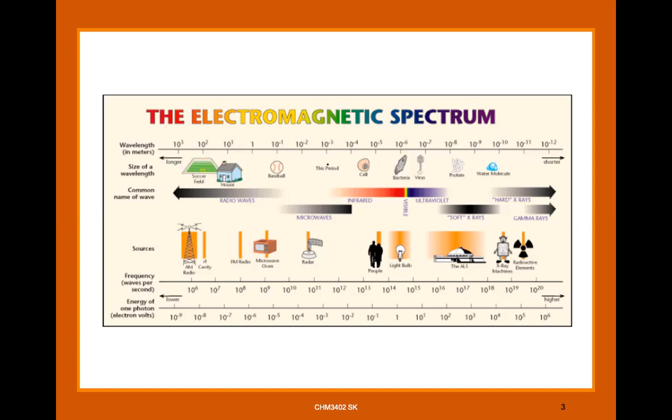Okay, so even though fluorescence is one type with much better sensitivity and selectivity, right? It is seldom used because it's quite limited.